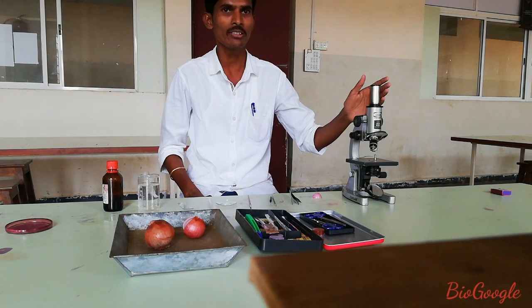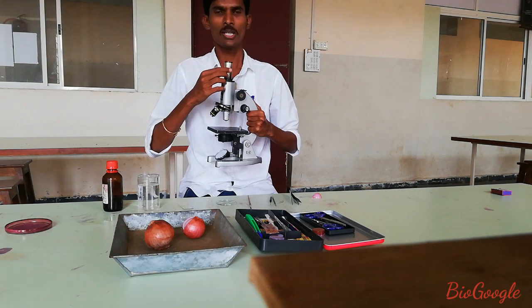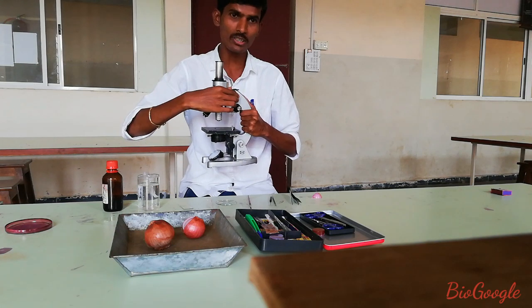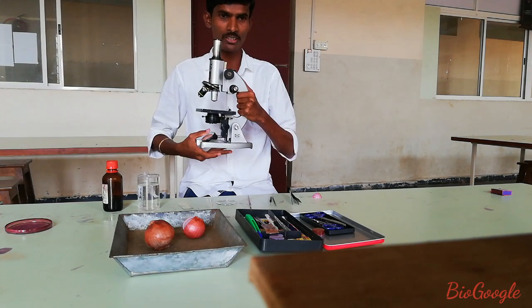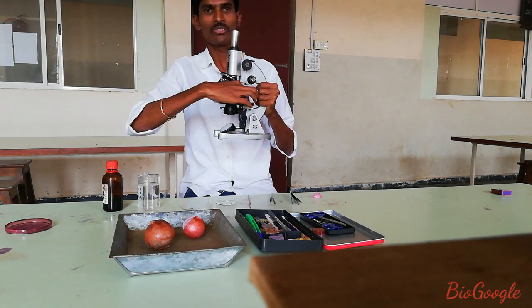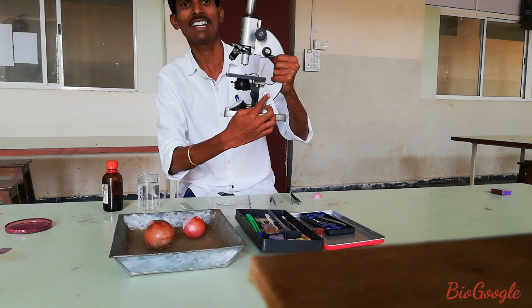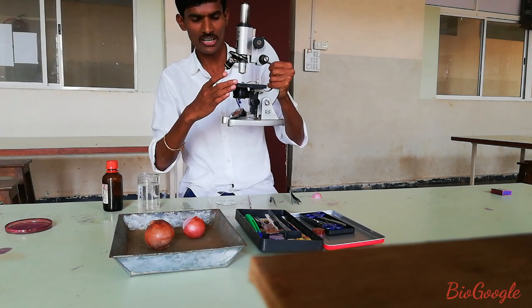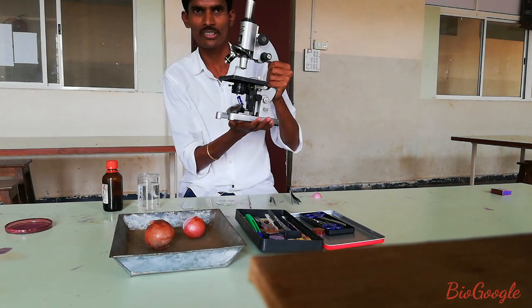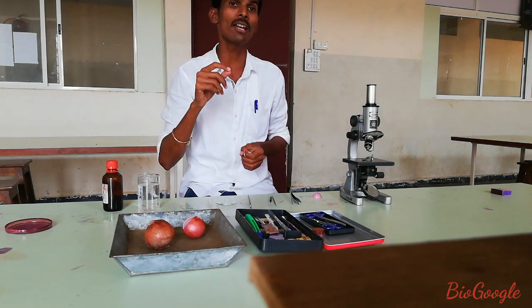First, we know the different parts of the compound microscope. This part is called the eyepiece. This is the body tube, this is the coarse adjustment, this is the fine adjustment, this structure is called the arm, this is the stage, this is the clip, and this structure is called the inclination joint. This is the stage, mirror, condenser, and the base. This compound microscope is used to observe simple cells or microorganisms.